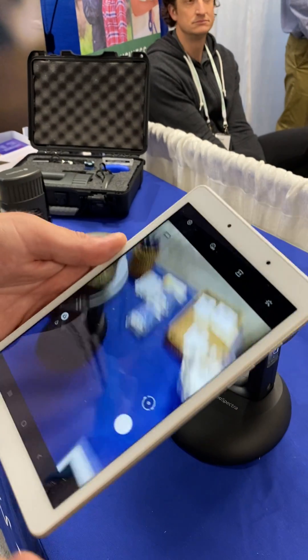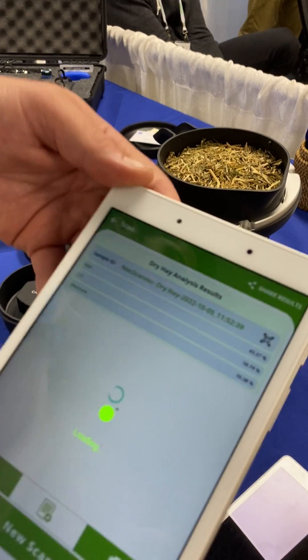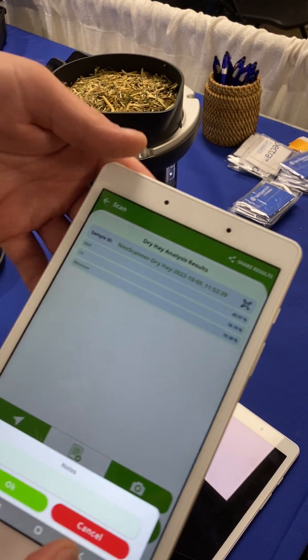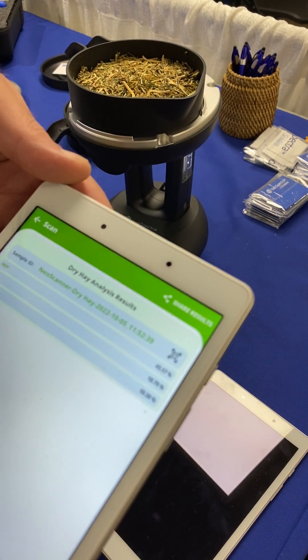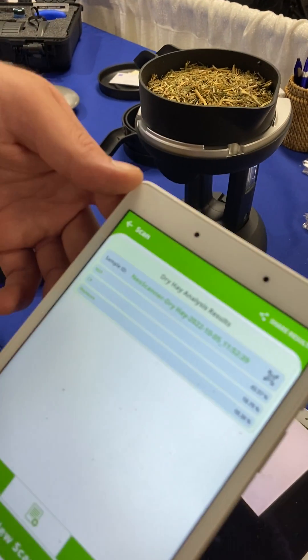For instance if you're tracking how each field is performing, and you have multiple fields that you're tracking, that is one way to analyze that. They would take it right out to the field, grab a sample, and you can measure right on the spot.